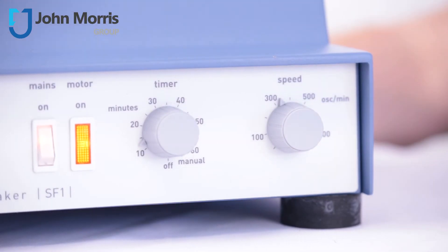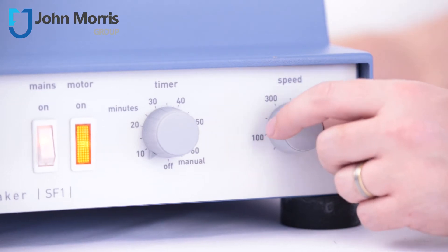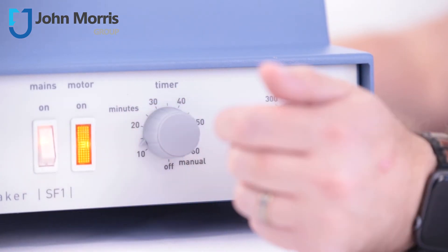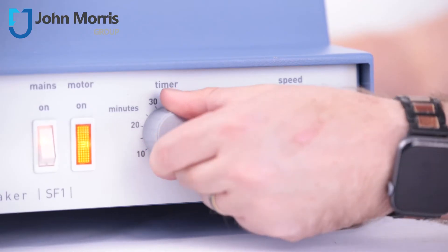Adjusting speed or time settings is easy with these two knobs. Speed is adjustable right up to a vigorous 800 oscillations per minute, and time can be set anywhere from 10 to 60 minutes. If you need continuous operation, just turn the knob all the way to the left.